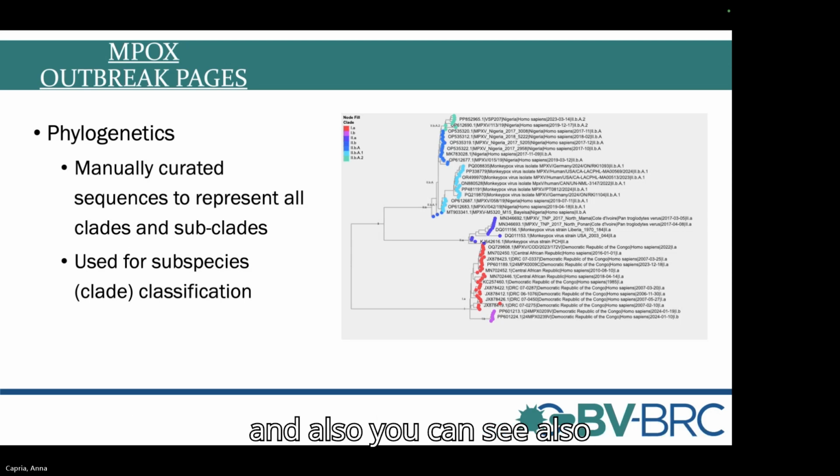Also, you can see we have annotated internal nodes with the clade information. We also have a subspecies classification service, and this tree is being used as a reference tree for the subspecies classification service.